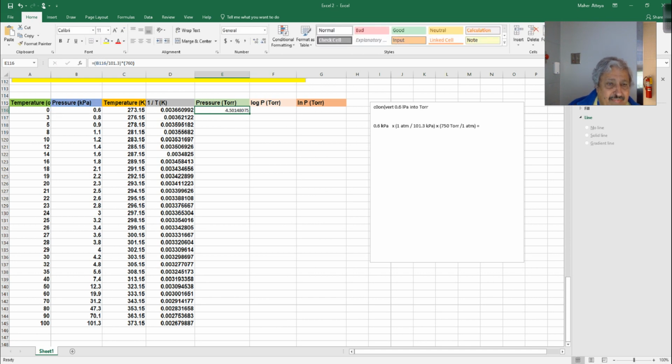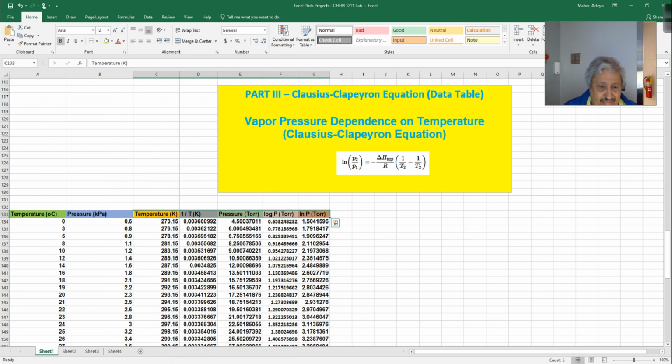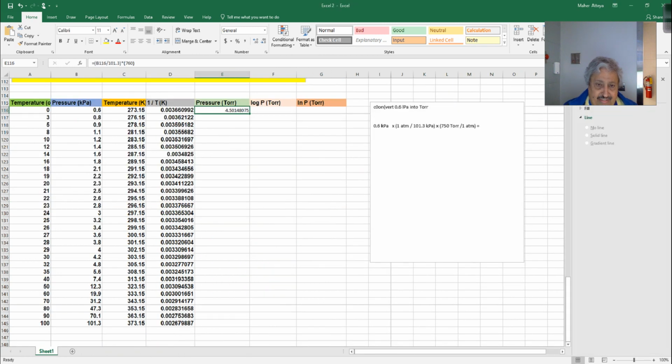Let's see. It came out 4.501. Let's see what they have here. It came out to be 4.501. So ours is good. So our calculation is good.